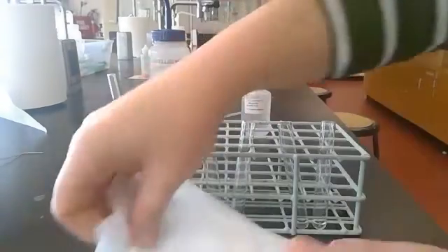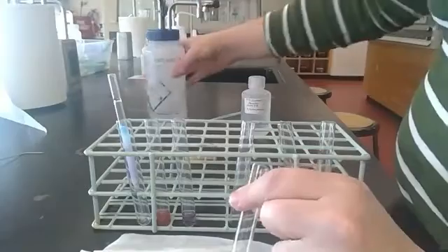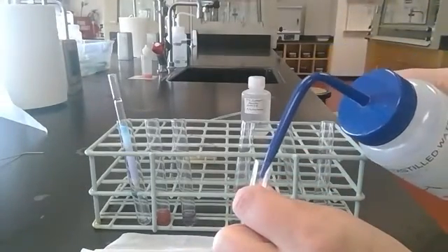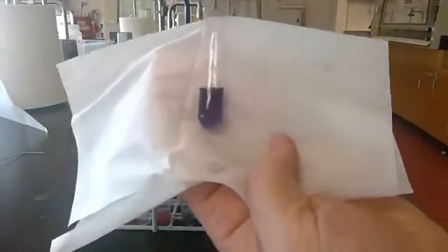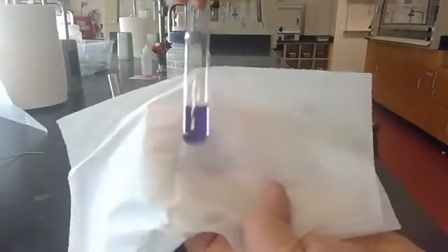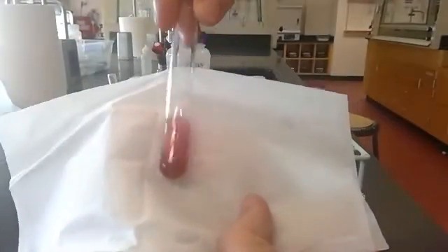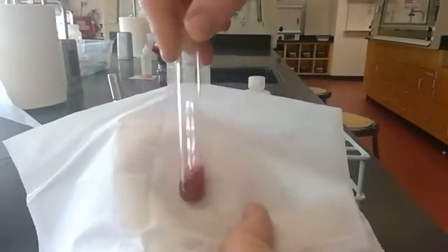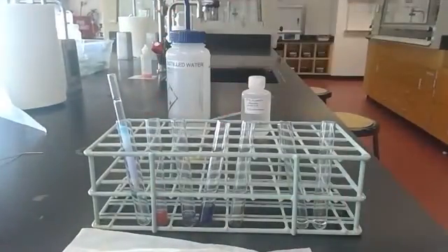And then when we added water, we were able to pull out the rest of the dye. And so when we added water, we had a polar stationary phase and a polar mobile phase. I'm actually going to dilute this, hopefully, so you can see the color a little bit better. Not sure how that's showing up, but it looks like a blue to me. And then we have what came when we put our polar solvent through our polar stationary phase, red. So we have blue come out first, followed by red when we have a polar stationary phase and a less polar mobile phase. The red came out when we then used a more polar solvent. We had more red come out.